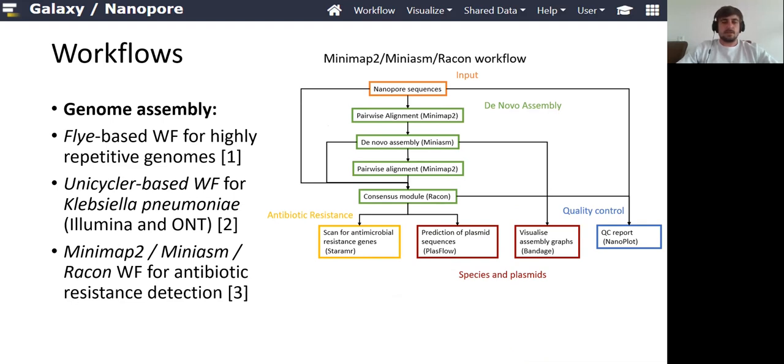You can use the short reads to accurately determine the SNPs, and you can use long-read sequences to more accurately determine the structure of the DNA. The last workflow that we created is a workflow using Minimap, Miniasm and Racon to assemble the plasmids or chromosomes. We added some tools to detect antibiotic resistance.